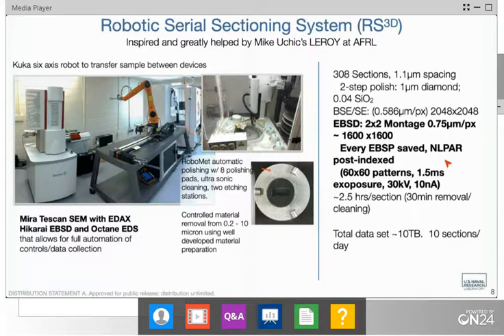And so building on top of that, a number of automated methods to make sure that we have accurate focusing, accurate positioning of our sample, all those types of things are quite critical. We do use fiducial marks to help with the loading and unloading. Just the stage itself, we're finding that we usually have an error of somewhere around 100 to 200 microns on positioning. It really can depend a little bit upon how we design these pucks that we're attaching our samples to. But by using these fiducial marks, we get our accuracy down to about 10 microns of repeatability. I'm certain that with a little bit more work, we can probably get that further collapsed.